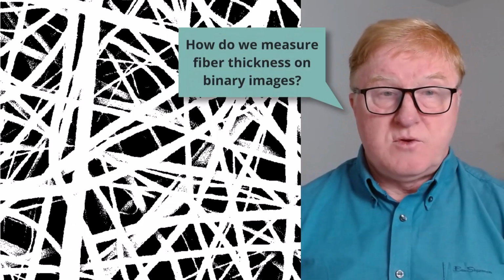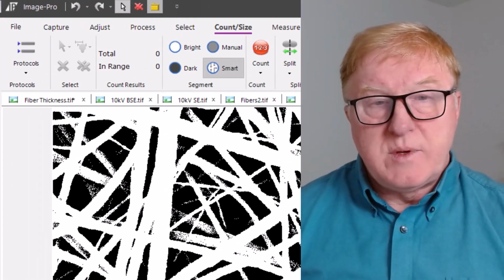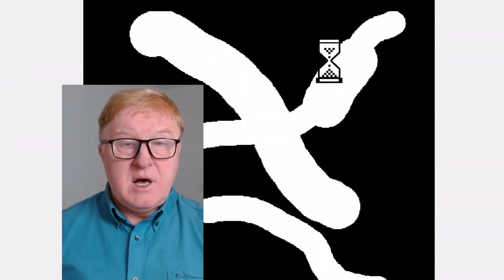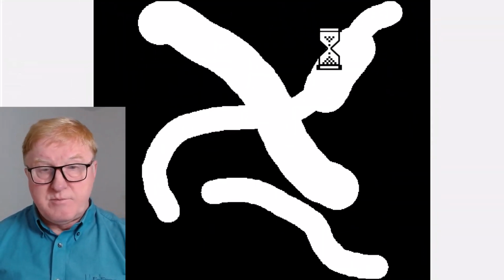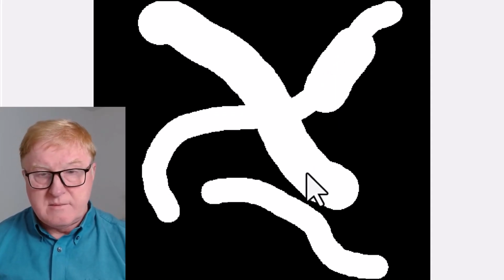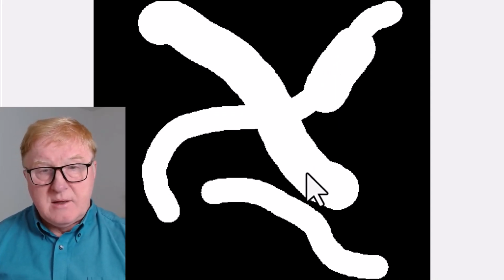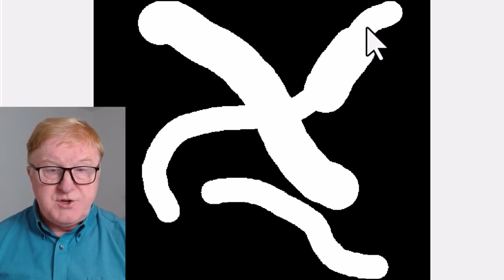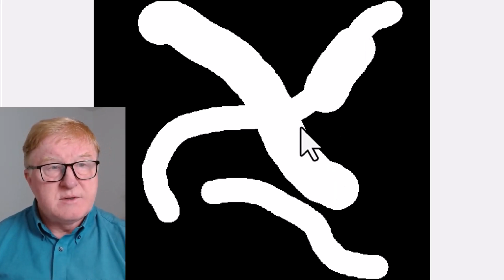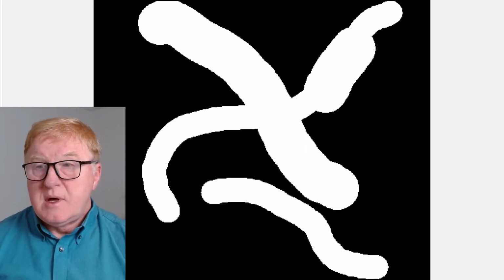Now let's talk about how to measure fiber thickness on binary images. I can draw a sample image, or I can just open an existing one, and we'll explain how we would measure thickness on this binary image. You can see that there are some fibers. These white lines are fibers. Some fibers cross each other, and they have different thickness. The way we measure this image would be to apply a distance map.